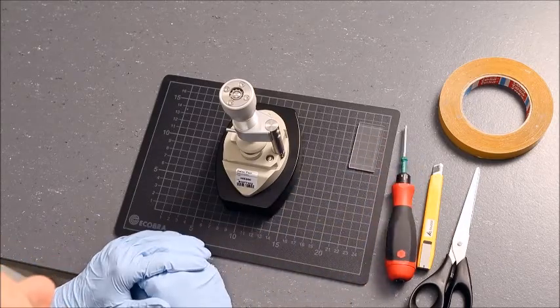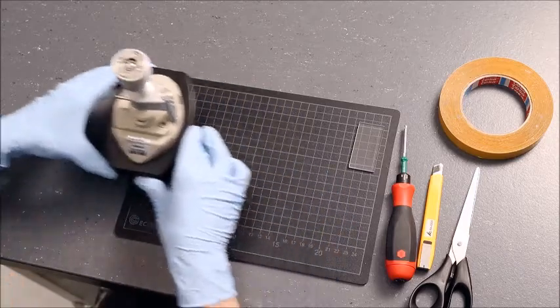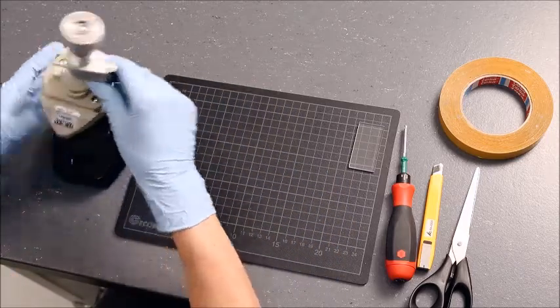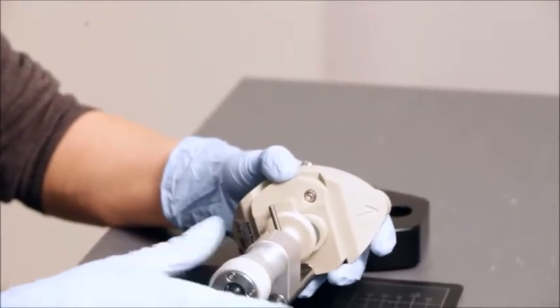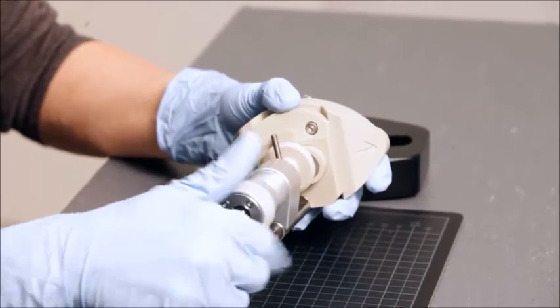First, you need to disassemble the cell. Loosen the adjustment knob. You do not need to remove the knob completely.